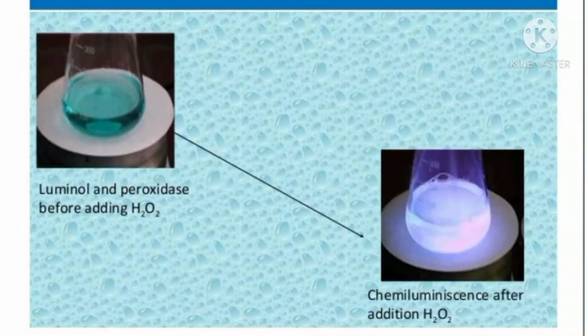The illustration shows the nature of reaction before and after adding hydrogen peroxide. Note the brilliant chemiluminescence after addition of hydrogen peroxide on the right bottom.